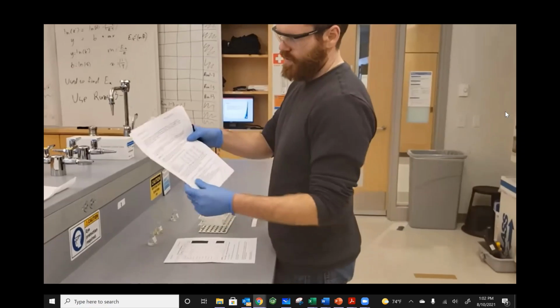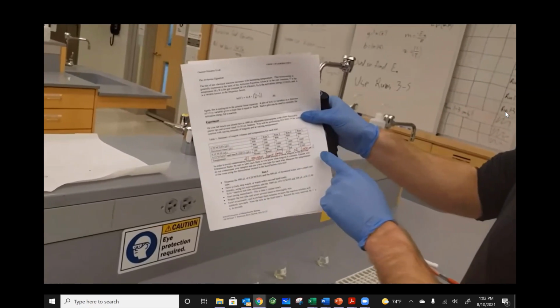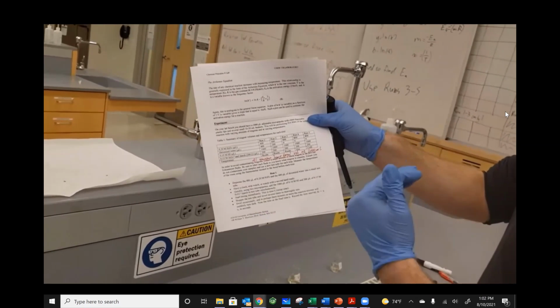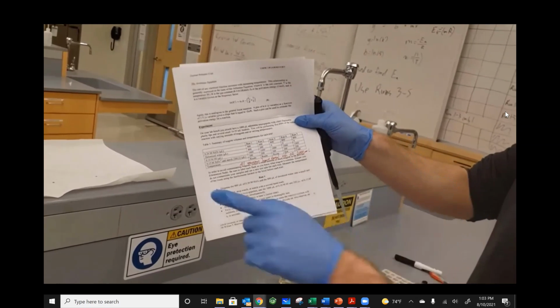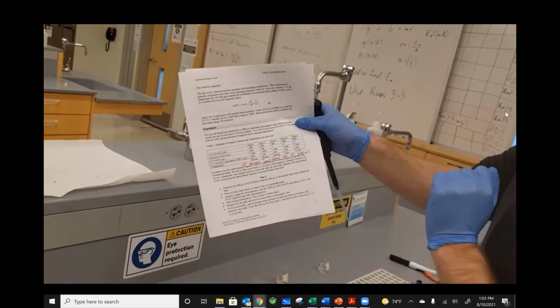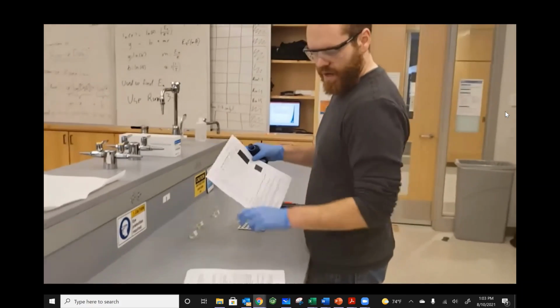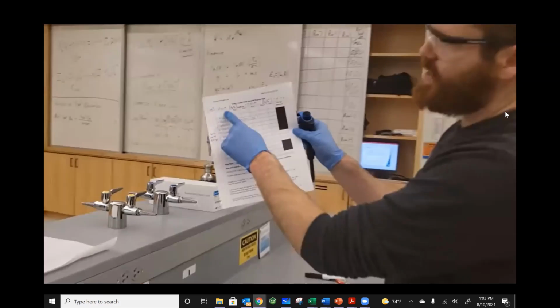All runs will involve you filling a test tube up, and once everything is filled up, all of them will have a volume of 2,000 microliters or 2 milliliters. So when you're doing M1V1 equals M2V2, these values are going to be your V1, and your V2 is going to be 2,000 microliters. What you need to do is figure out M2. You should have the concentrations written down in your printout, but if you are uncertain of them, they are at the top of my table here.